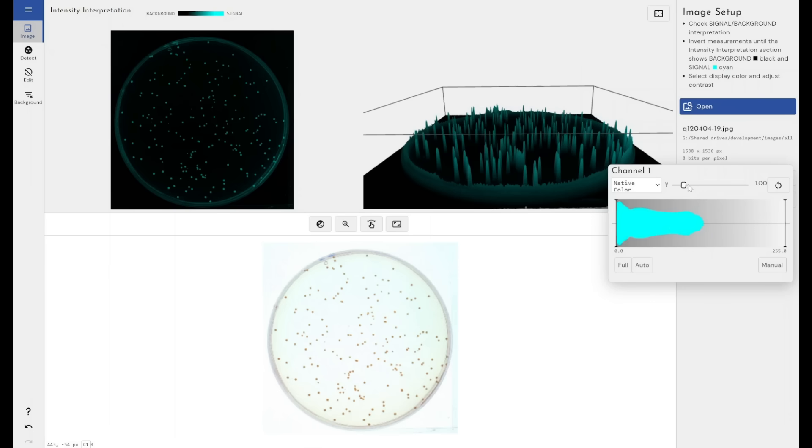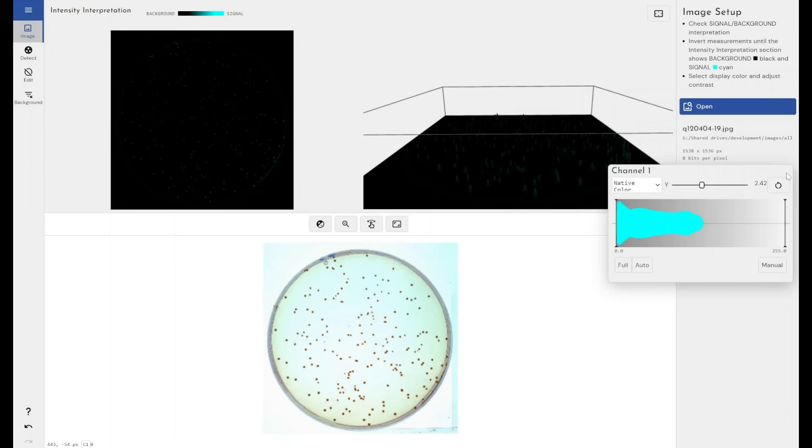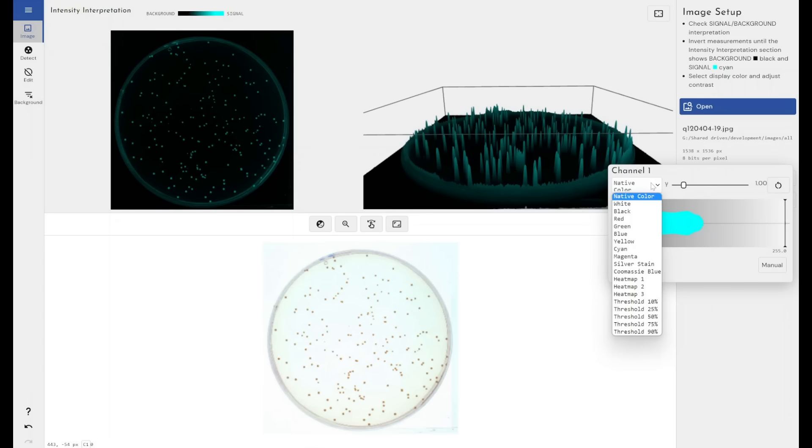We have the brightness slider up here. We have a number of false color heat maps that we can apply to our image to increase the contrast between what we're trying to measure and the background of the image. It's quite obvious where our colonies are on our plate here.